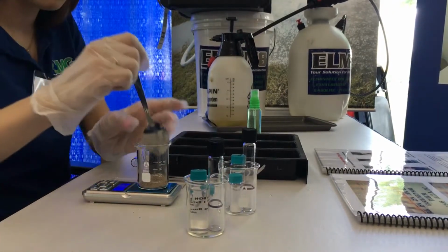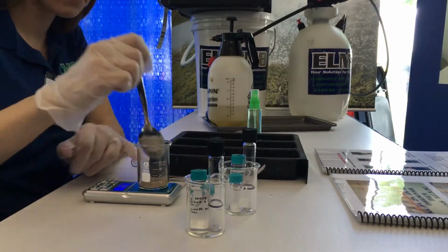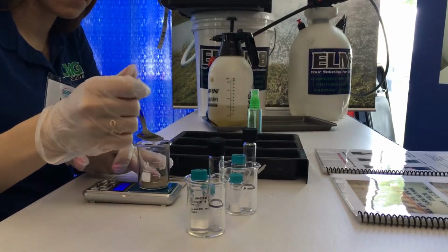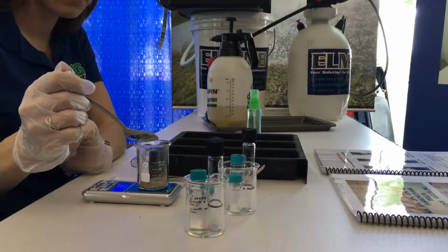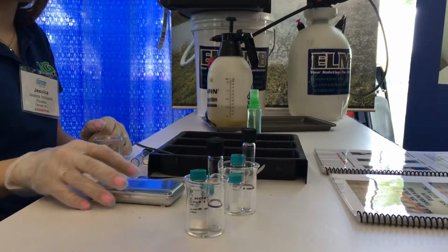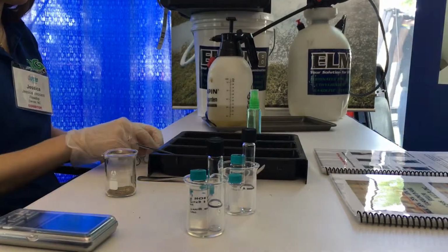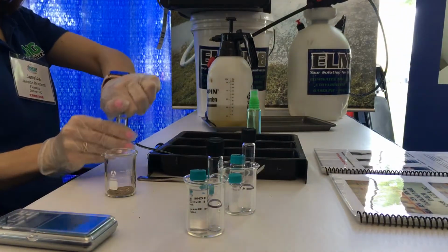So what she's going to do right here is measure out 5 grams, 4.8 to 5.2. We measure out 5 grams of soil because that's the EPA recommended sample size for doing soil analysis. In the real world, it doesn't have to be 5.00. It can be 4.8 to 5.2. It's more important to get that soil sample measured out as quick as possible and get our solvent on there.